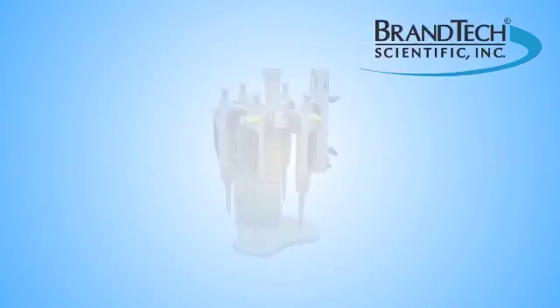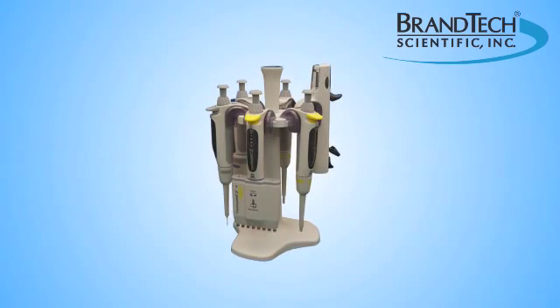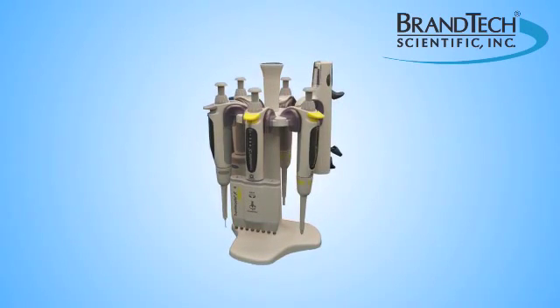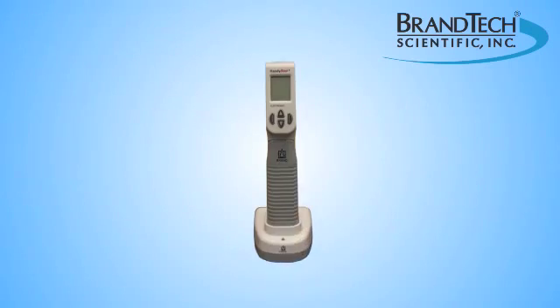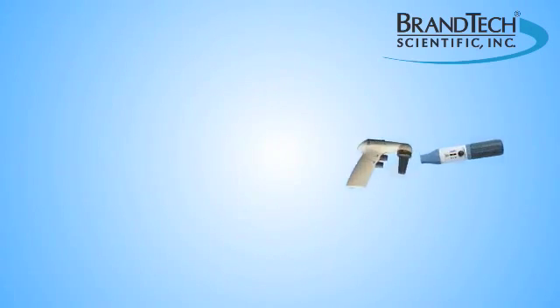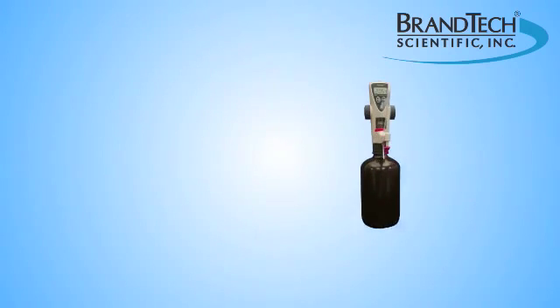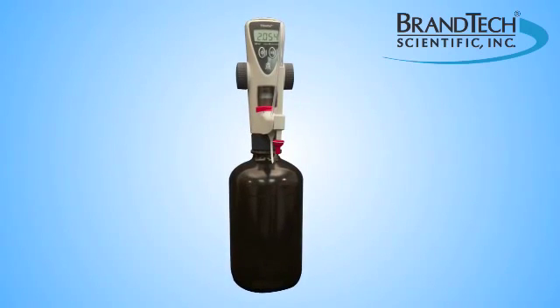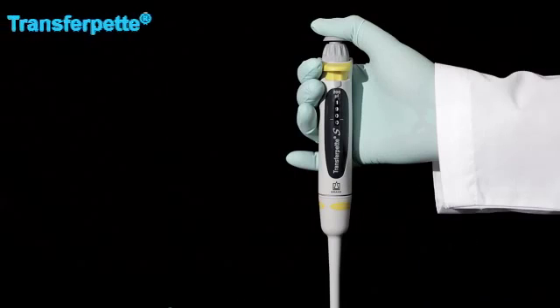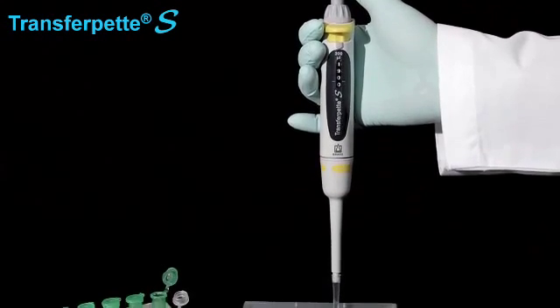Brantek Scientific offers a full line of liquid handling products including single and multi-channel pipettes, repeating pipettes, pipette controllers, bottle top dispensers, and bottle top burets. Today we will explore our Transferpette S pipettes.